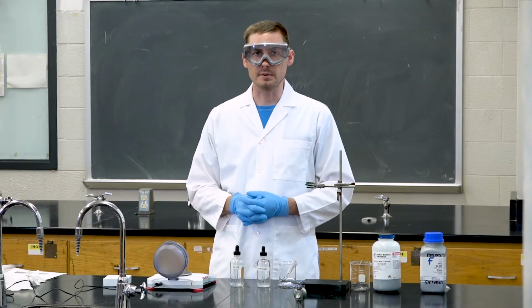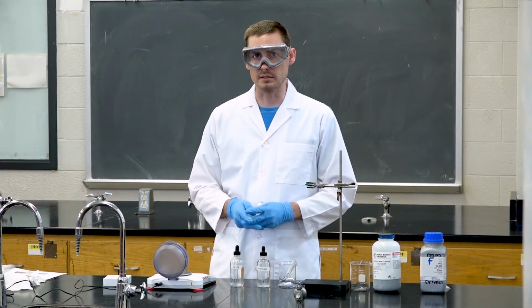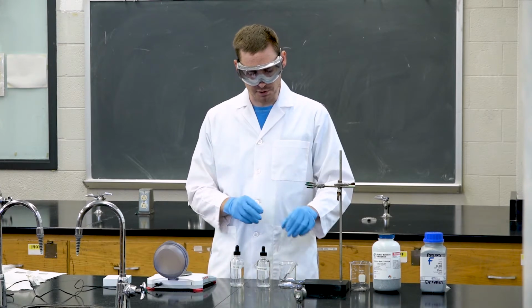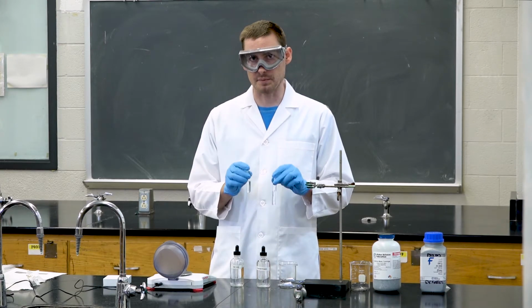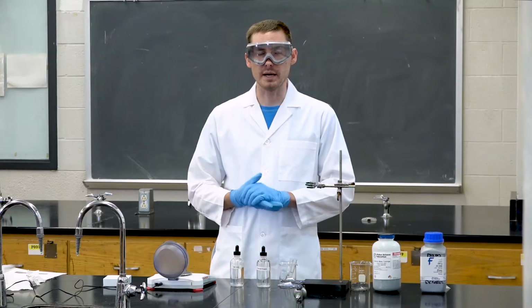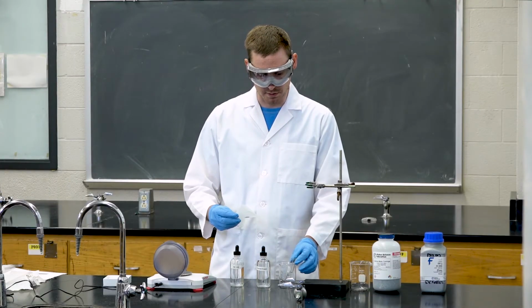So for this part of the experiment, we're going to be observing the reaction between deionized water and the metals when we add them to test tubes. So first we're going to need 2 test tubes, both filled with about 5 milliliters of deionized water. And then we're going to need to weigh out 0.5 grams of zinc for this first part. We can then add this to the test tube.